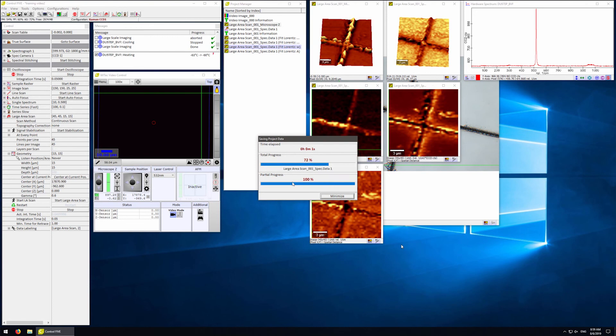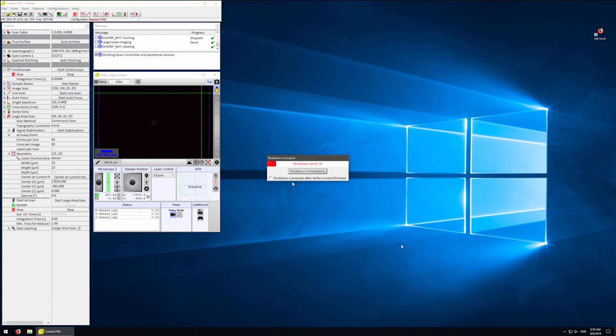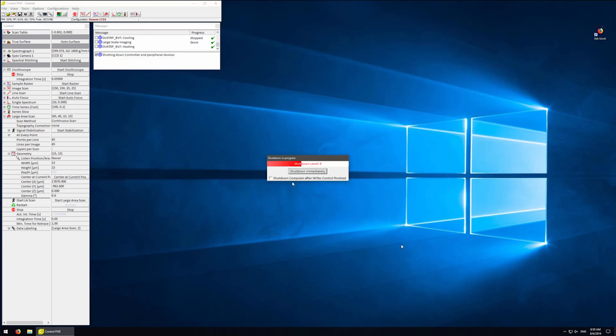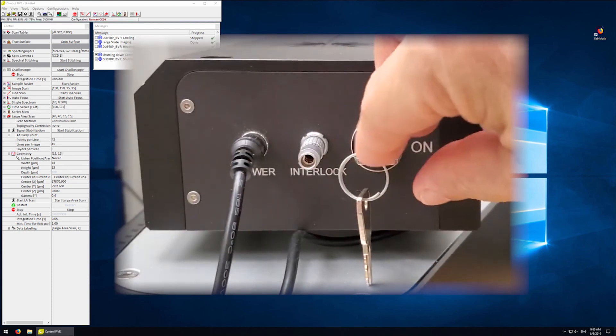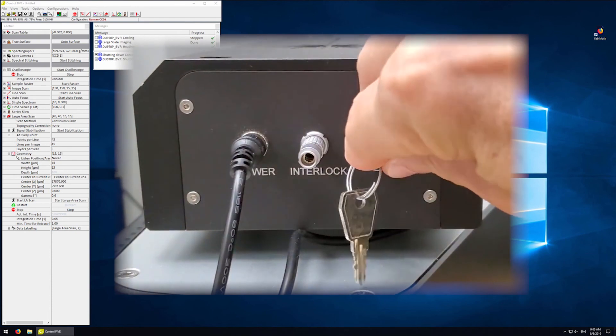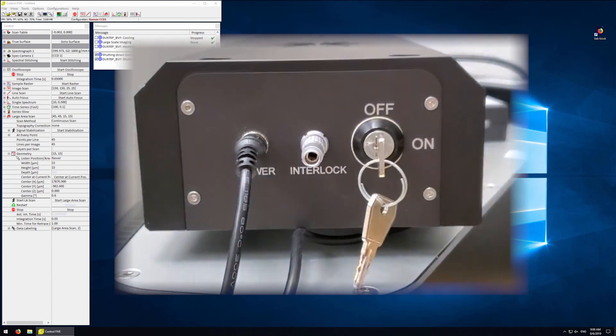Make sure you let the software fully complete the shutdown. Do not interrupt the shutdown or the camera will stay cooled down. Finally, make sure the laser shutter is closed and turn off the laser by turning the key in the back.